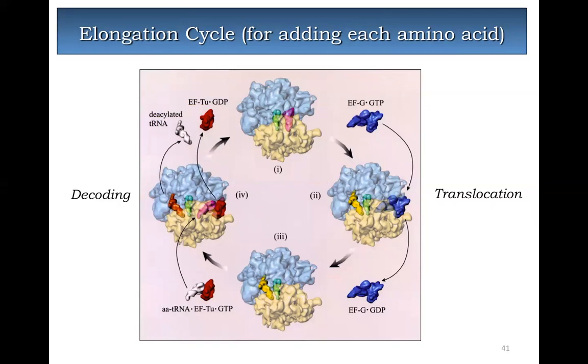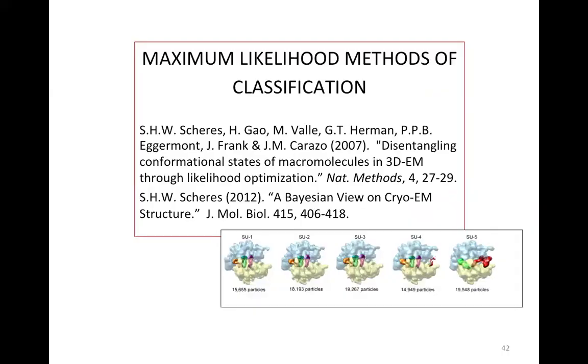To arrange this, we had to find the way the relevant ligand molecules bound to the ribosome, and these were the tRNAs, mRNA, or EFG, the elongation factor that moves the ribosome along after the peptide transfer, and then also EF-Tu, which together with the tRNA enters the ribosome in order to satisfy the next decoding event.